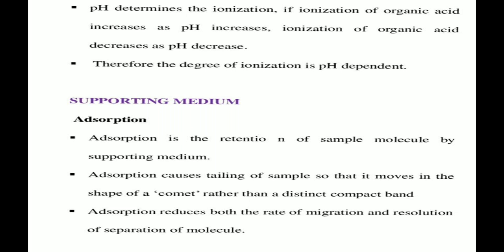Okay, and now another factor that can also affect the electrophoresis, but this is not in your syllabus, but let me tell you what actually and how actually it affects the electrophoresis. ठीक आहे, मग सपोर्टिंग मीडियम दॅट कॅन ऑल्सो बी अ फॅक्टर of the electrophoresis.